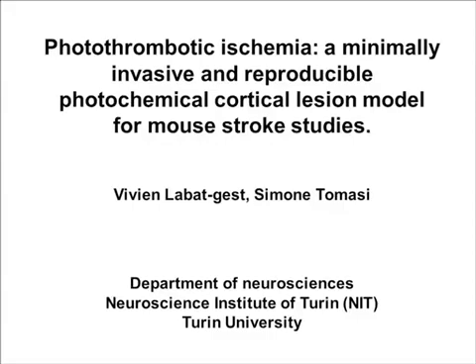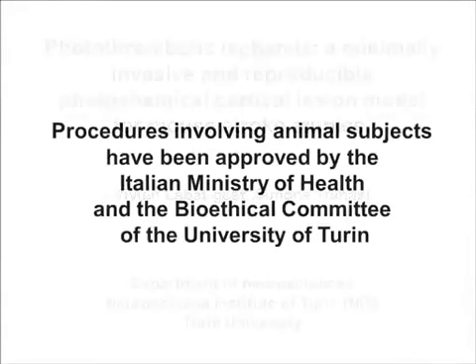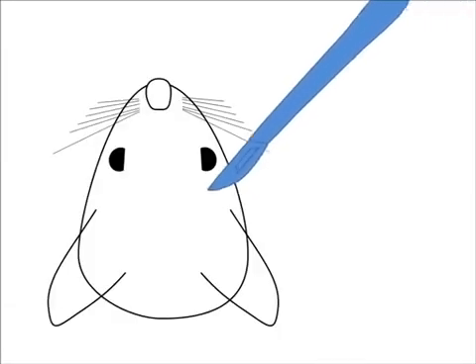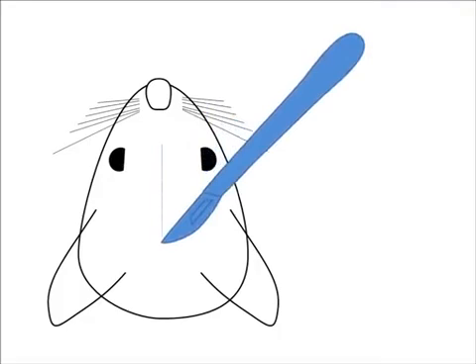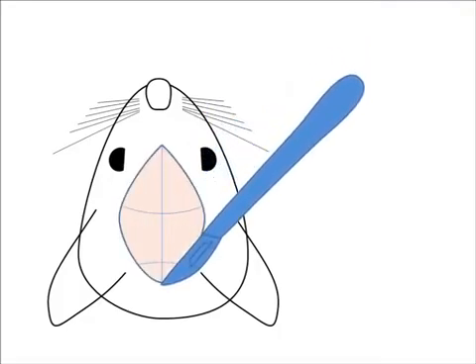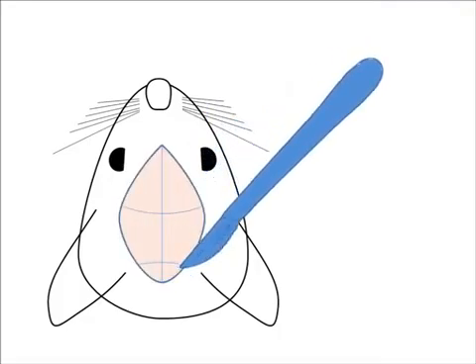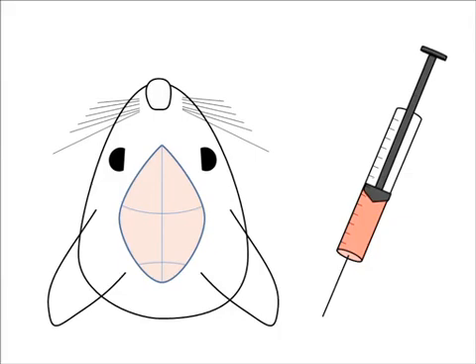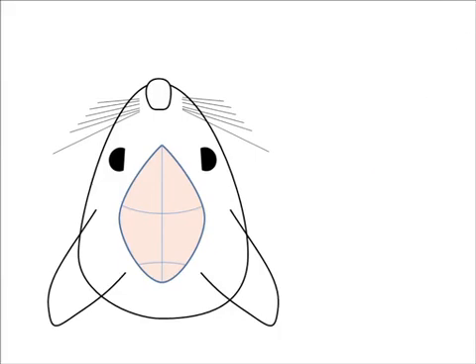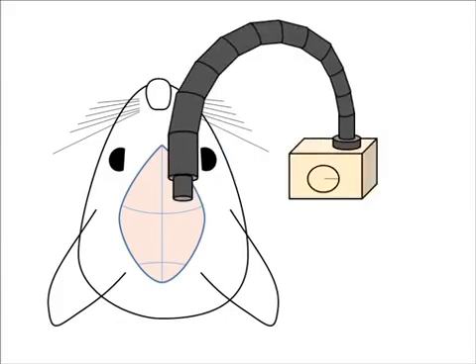The overall goal of this procedure is to induce vascular thrombosis and ischemic damage within a given cortical area by means of photoactivation of a previously injected light-sensitive dye. This is accomplished by first making an incision on the skin in order to expose the skull. After that, a photosensitive dye, rose bengal, is injected intraperitoneally. 5 minutes later, the target cortical area is exposed to a cold light source for 15 minutes.